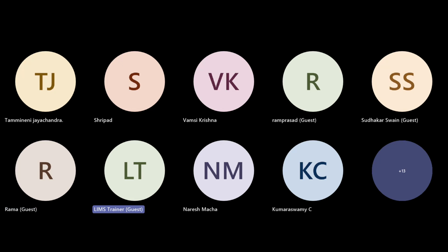And if we get time, we look into some LIMS basic code. But again, for LIMS basic code, you need more time. You need to know first of all what a loop is, right?